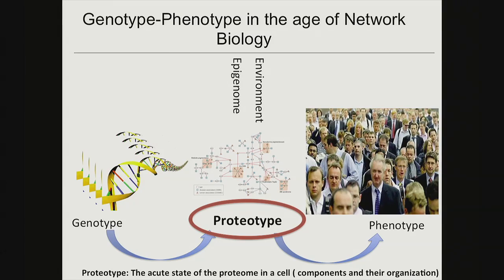We can measure some proteins quite effectively, as Marco did and Matthias Gsteiger is continuing to do here, but it's a lot of work and it's slow. So the only way we currently know to make these associations between proteins cooperating in some function is by correlation or association. We basically make a statistical argument. We would love to measure this directly, but we can't, and so we have to make inference.